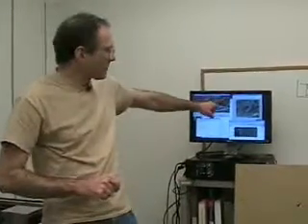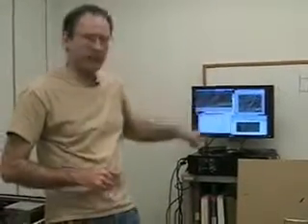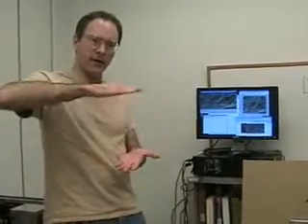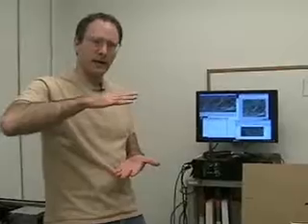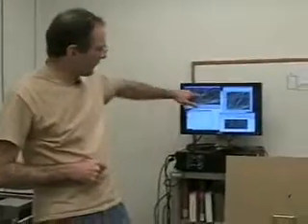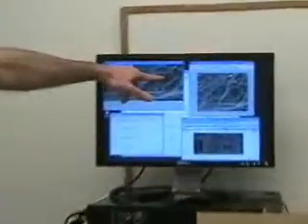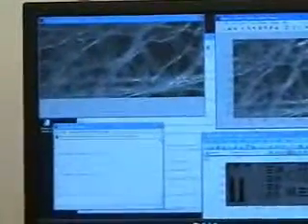So I'm scaling when I have just a little bit of red in my image. It means I'm just saturating a little bit, which means my brightest things are at the maximum intensity the camera can handle. That's good. And you'll notice in the areas in between, things are sort of a light gray. The question is, how can I get those areas darker? I want the darkest thing in my image ideally to be completely black. And the only way to do that is to reduce the ambient light that's hitting the sample.